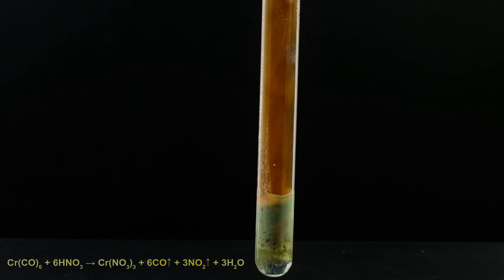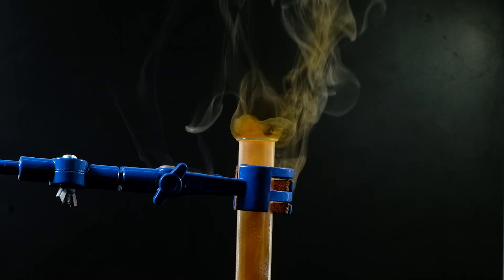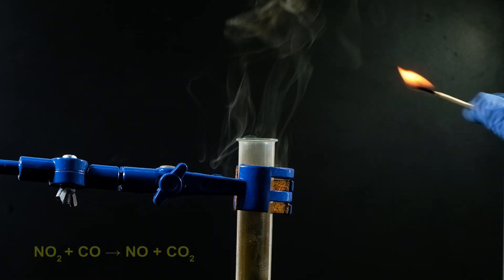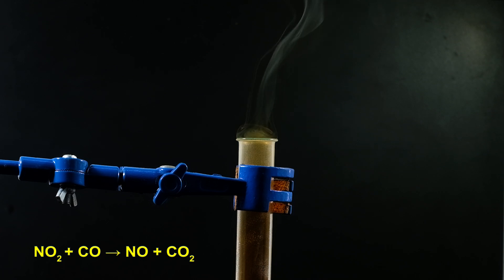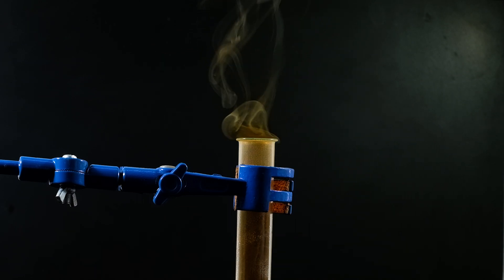To demonstrate this reaction, setting the evolved gases from the test tube on fire is just enough. Notice how instantly the orange color of nitrogen dioxide disappears after the flash, and how quickly it reappears. It will be seen a little clearer on white background.